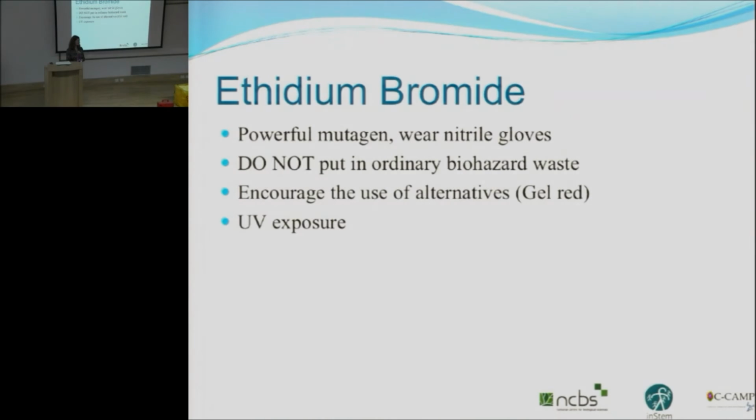Fatigue is a real serious consideration when you work in a laboratory. You'll see many people are enthusiastic and they do work late at night. But if you're tired, don't start the experiment. It can begin the next day, okay? Keep yourself safe at all times.